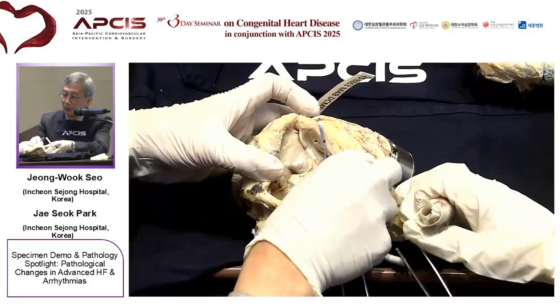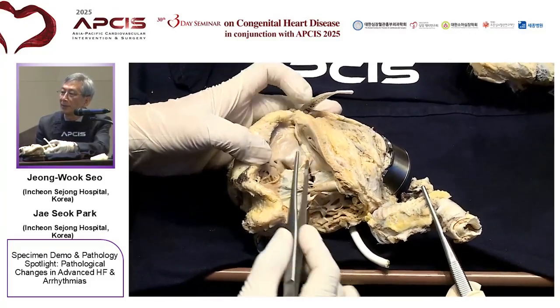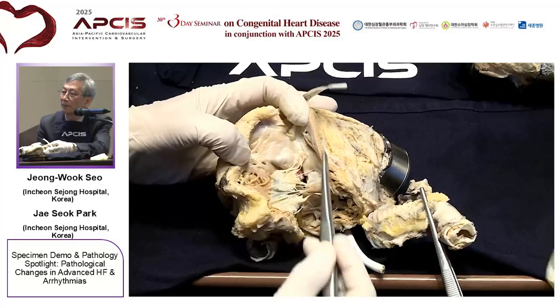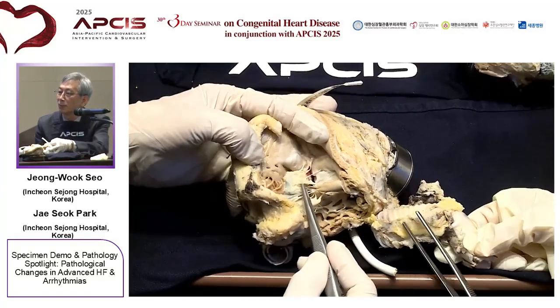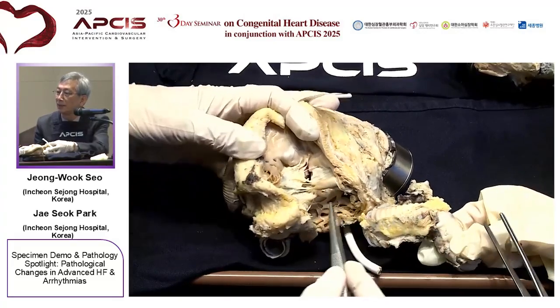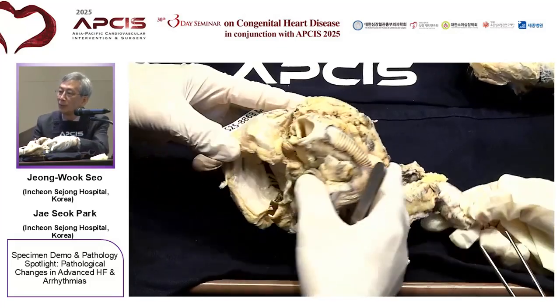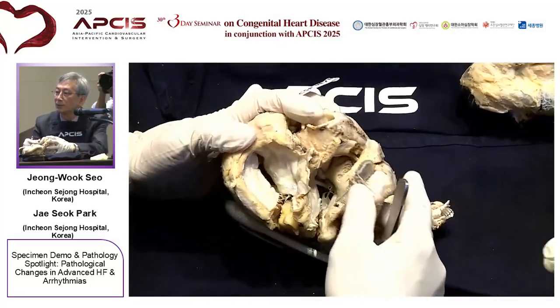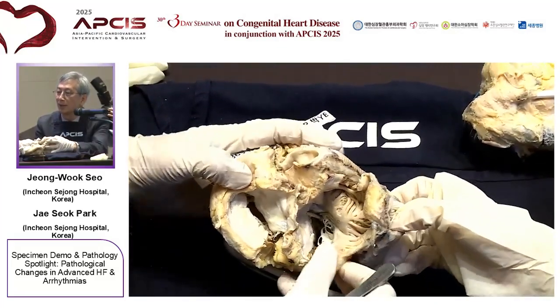Yes. Right ventricular septal surface, this is the anterior papillary muscle, this is the pulmonary valve, and this is the septal surface, leaflet, and anterior tricuspid leaflet, septal leaflet, and so on. Also we saw in this view the mitral valve and tricuspid valve.